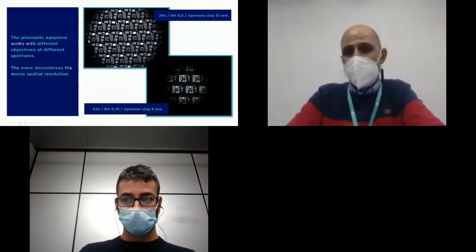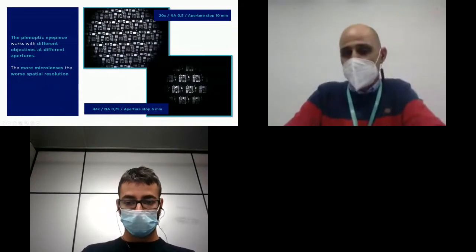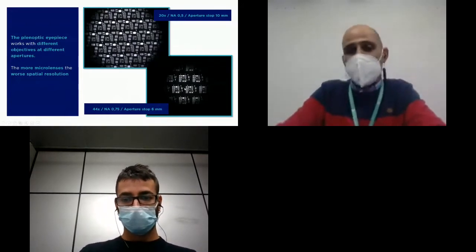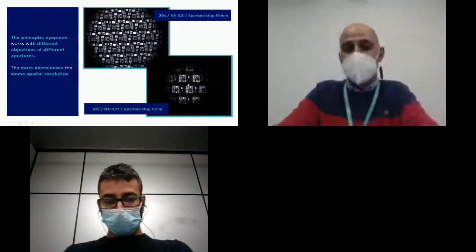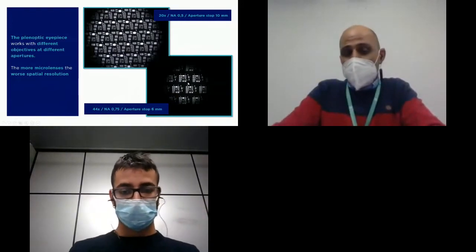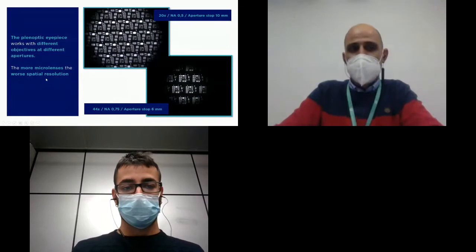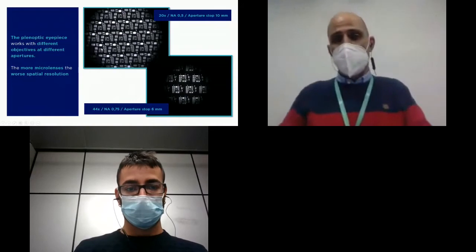Here we have 5 views in this aperture, and here we have 3 views for a bigger numerical aperture, but a smaller stop aperture. The price to pay is, if we have more views, we have worse spatial resolution, but bigger angular resolution.